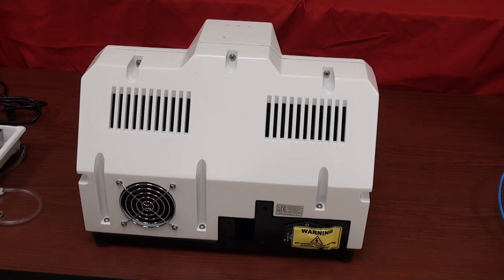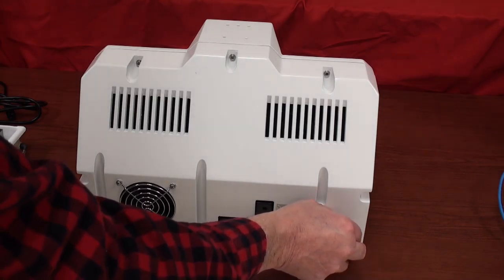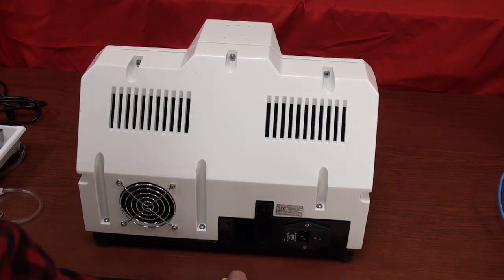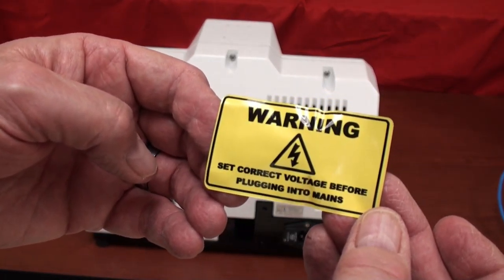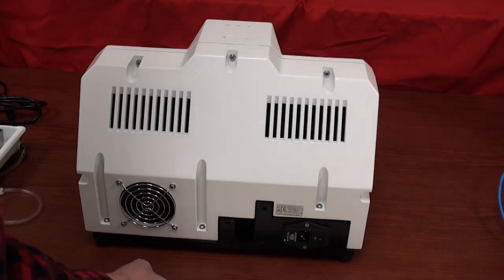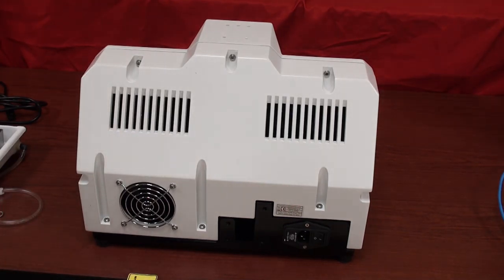This is what the rear of the unit looks like. There's a cooling fan and cooling vents, and there is a warning sticker over the outlet. This is to make sure you set the correct voltage before plugging the system into your wall receptacle. I've often seen in the US that it is inadvertently set at the factory incorrectly — the customer plugs it into 110 volts but the machine is expecting 220 volts and it doesn't operate. It's simply a matter of changing the voltage selector switch.